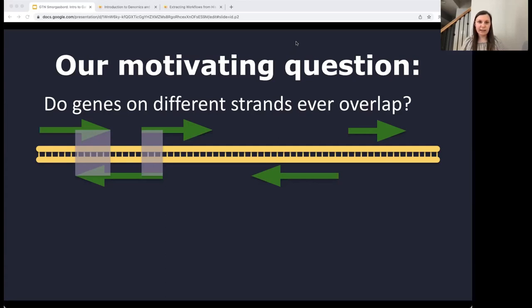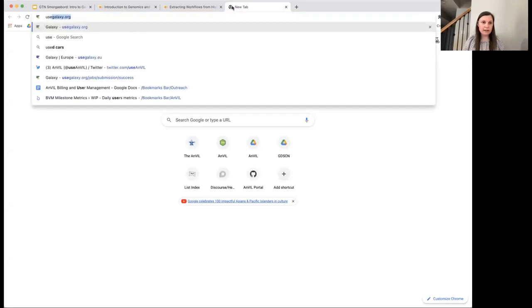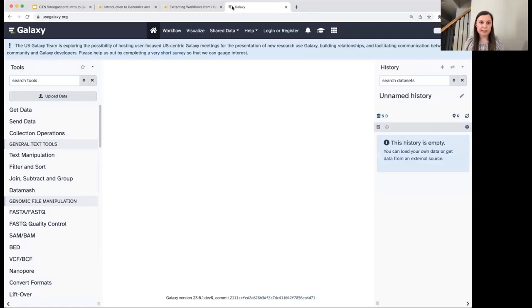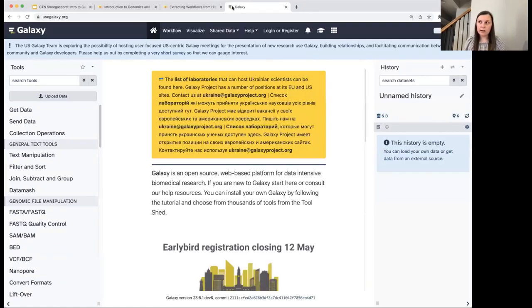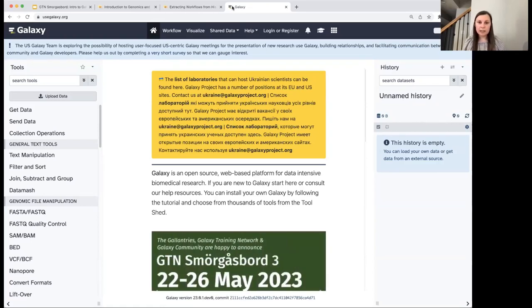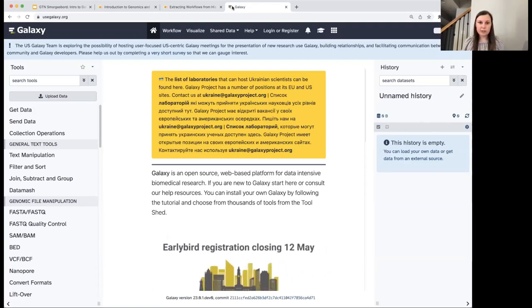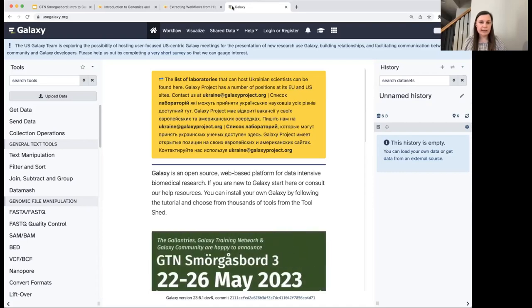Now let's get into Galaxy. I'm going to open up usegalaxy.org, which is a public server based in the US. There are also main servers at usegalaxy.eu for those in Europe, and usegalaxy.au in Australia. I'd suggest using one of those three main instances, and using the one that's closest to you.